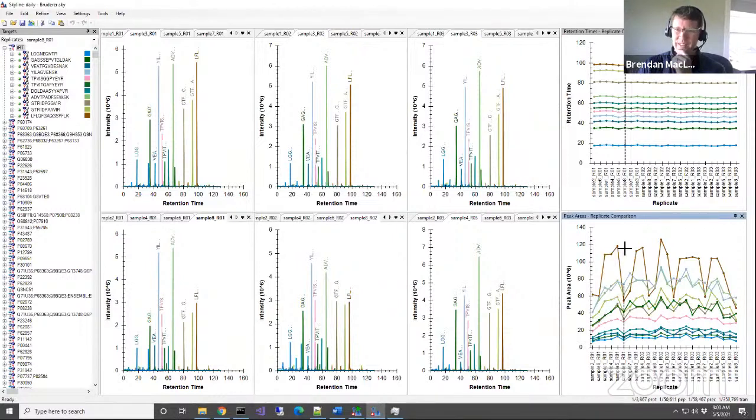That's why we might want some form of normalization, like a global standard or median normalization, when we process these data, because there's way more variance in some of these peptides than we would expect from standards injected at a constant concentration. But even the ones that are pretty stable have this curve over the life of the experiment. So I always find it a little bit interesting, before I go look at any of the other stuff.